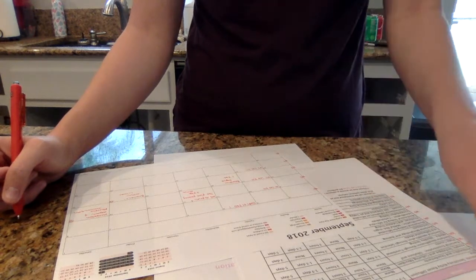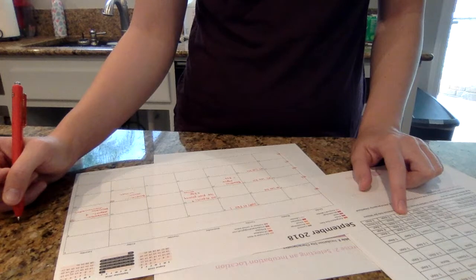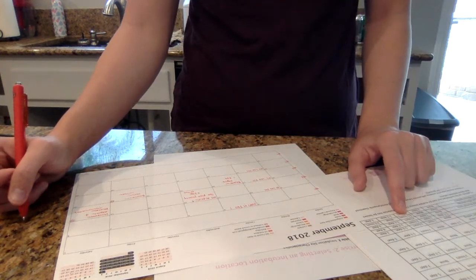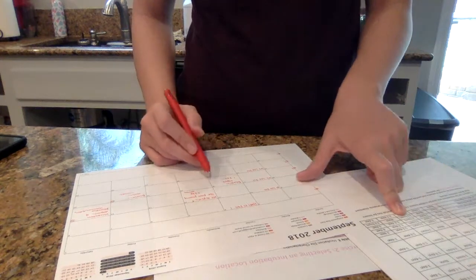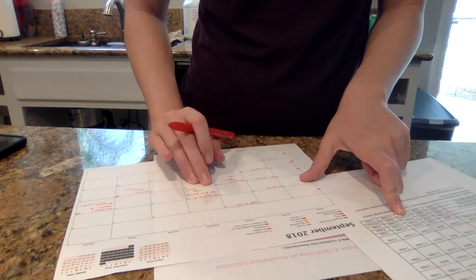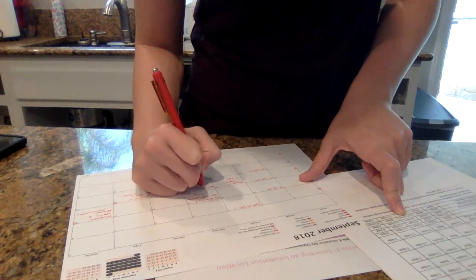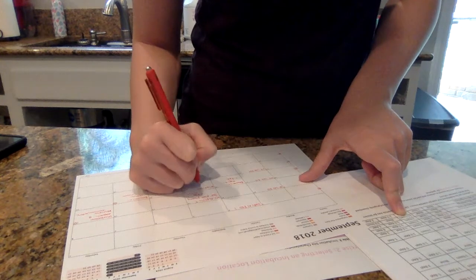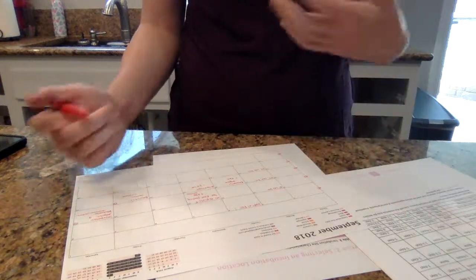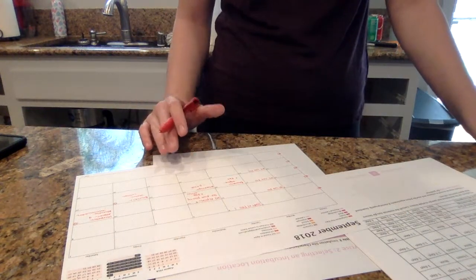There's actually going to be the microscope for microbiology. So there's no active culture, no plate pouring. The active time is 3.5 hours. So I'm going to go ahead and schedule that on Wednesday since my other things will be in an active culture. That way I have that amount of time to look under the microscope and record. So it says 3.5 hours is the time allocation for that lesson.